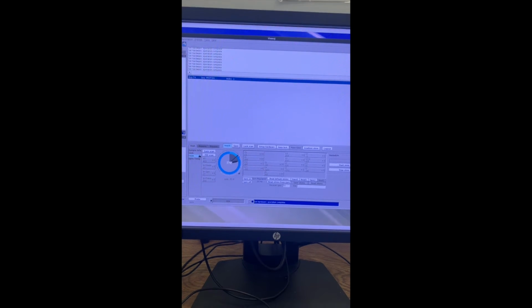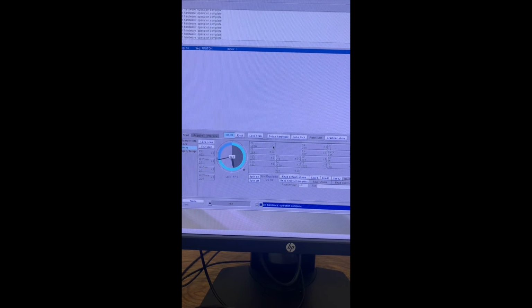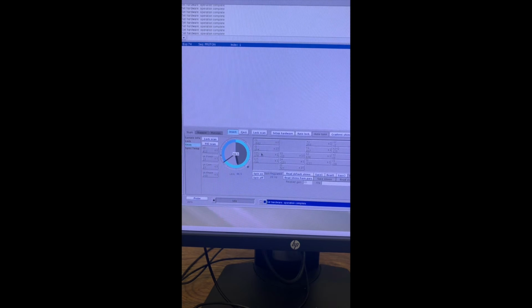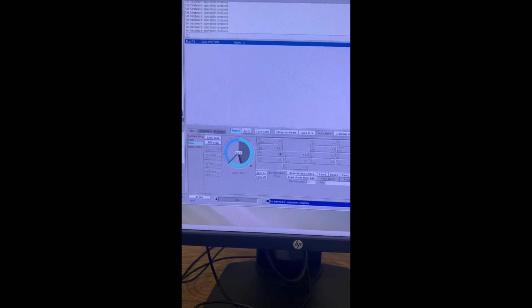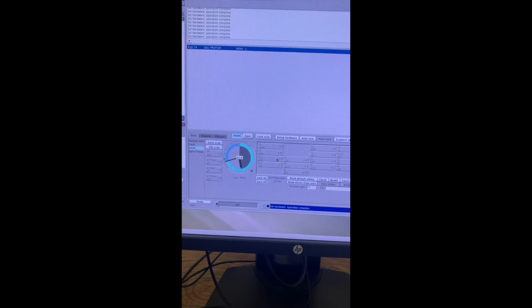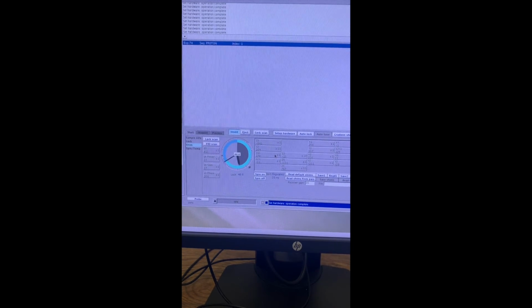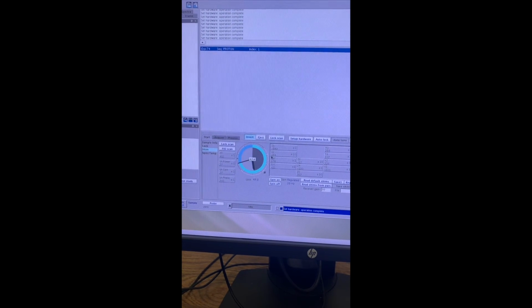to the shim tab. In the shim tab, you're not going to touch anything on the left, the Z0 lock power and lock gain, because those are already optimized when you did the lock signal. What you're going to adjust though is the Z1, Z2, and Z1C signals. You can adjust them also by the increments of 1, 10, or 100. And what you're going for here is to optimize the signal strength. You're going to look for the field to increase, and you want a signal strength between 60 and 70 range. In case of a surge, you don't want to fry the machine, but you don't want it to be too low that you're not going to get a signal.